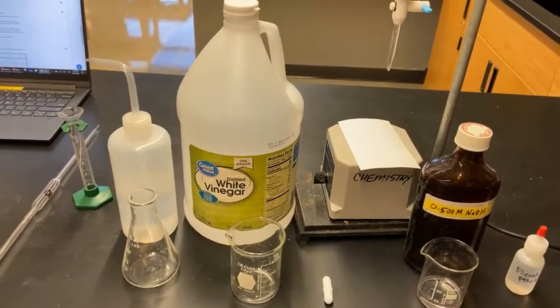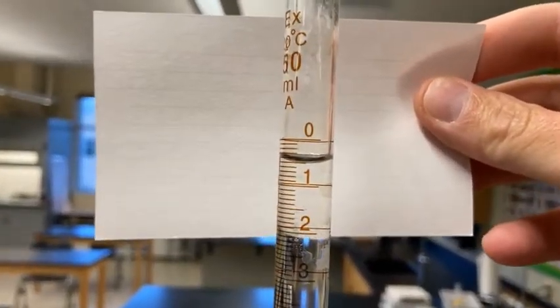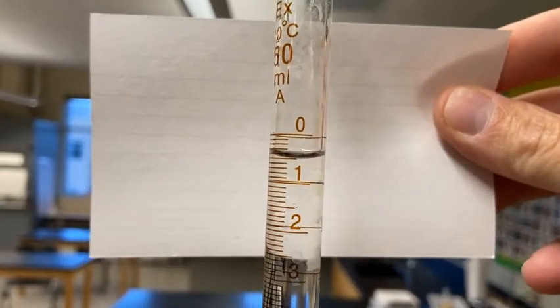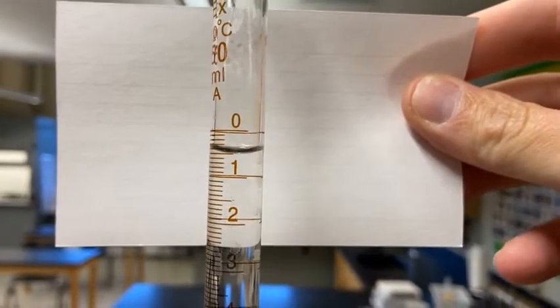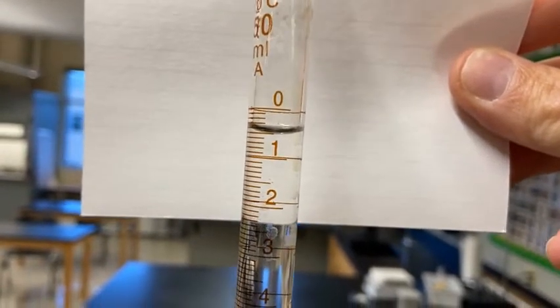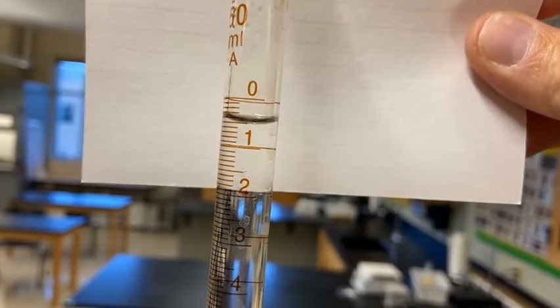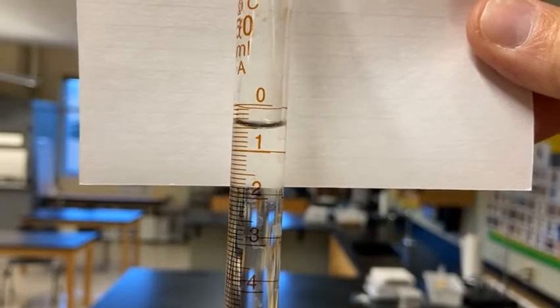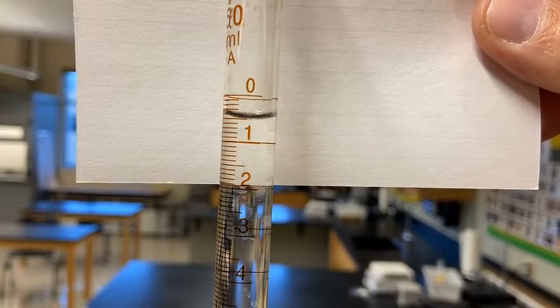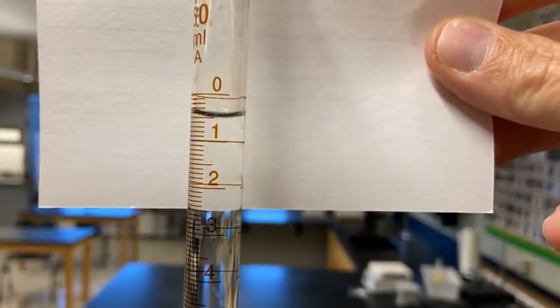We'll be titrating the white vinegar, which is our analyte, to find the concentration of acetic acid. I've already filled the burette and I'll show you where it is. I'm holding a card behind it so you can see it better. Remember, you read from the bottom of the meniscus. An important thing about burettes: they read from the top down — zero at the top going downward. You always read to two decimal places, estimating between the lines. Right now it looks like about 0.49 or 0.50 milliliters. That's your first reading.